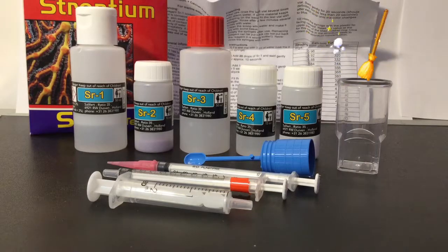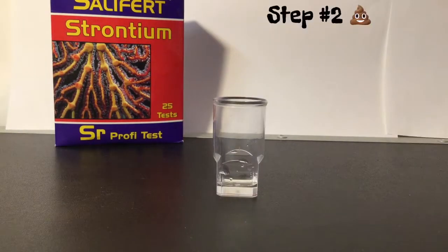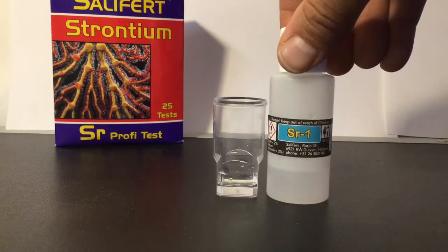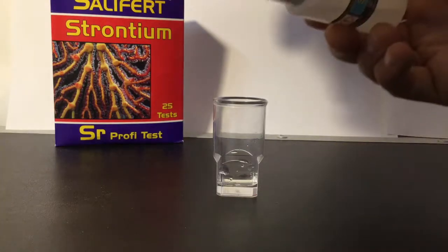Last but not least, your clean test vial. Step one: fill the test vial with two milliliters of aquarium water. Step two is kind of tricky — you have to add 20 drops of the SR1 bottle. It's tricky because the bottle sometimes drops double drops and it's just a pain. If you have the test kit, you'll see what I mean.